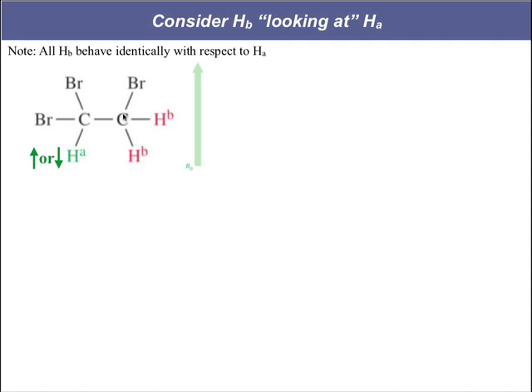So hydrogen B should have a chemical shift associated with it. Let's say the shift is there. I'm just going to draw a line to say where the shift is. Now, let's say that hydrogen B feels hydrogen A with A spinning with the magnetic field, so aligned with the magnetic field. That means that B feels the external magnetic field plus A's magnetic field aligning with it.